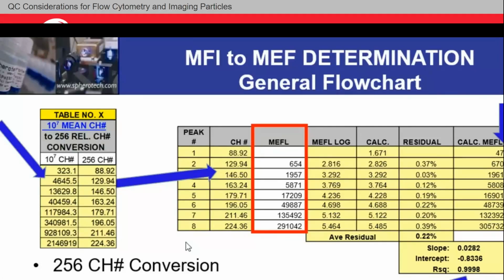But if we're looking at this and we say, this population is 30,000 times brighter than that population, and we have a 0.999 confidence on it, we can say that. And that's the beauty. That's the power. That's the whole reason why many of us are even in this field.